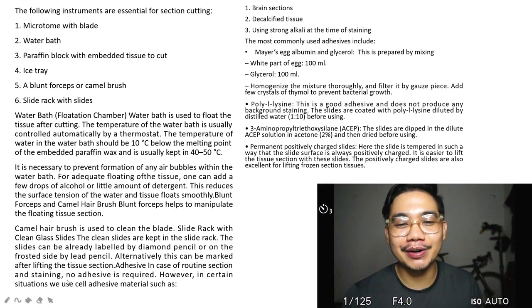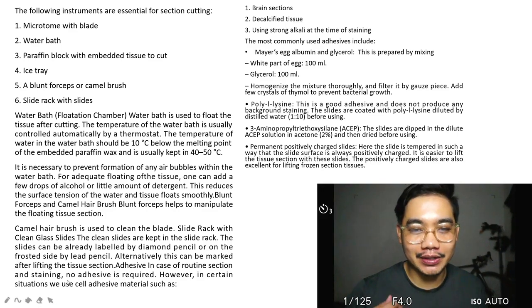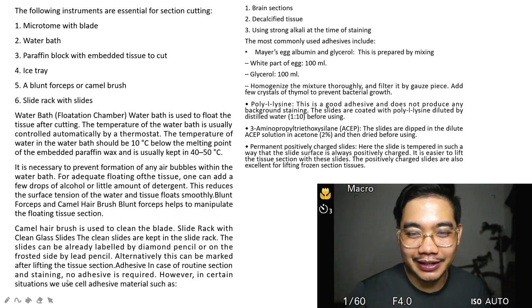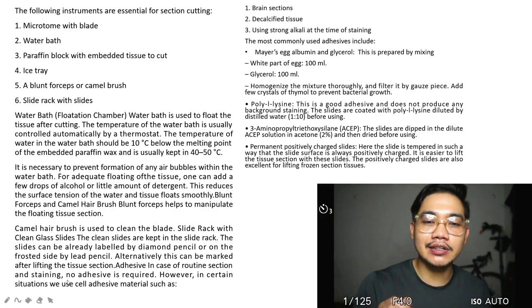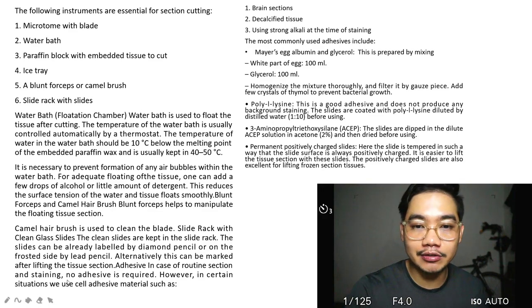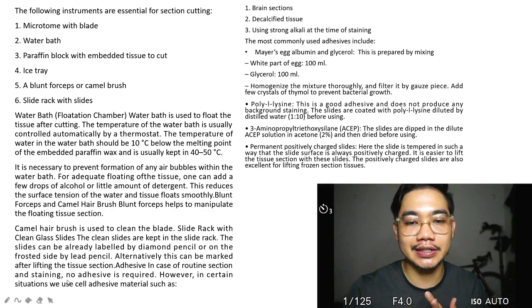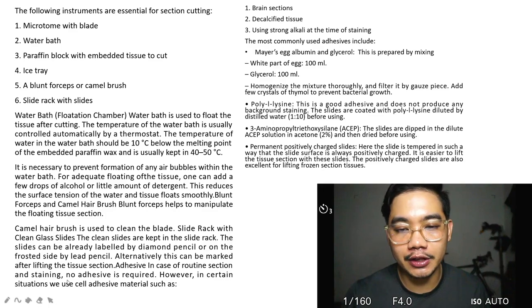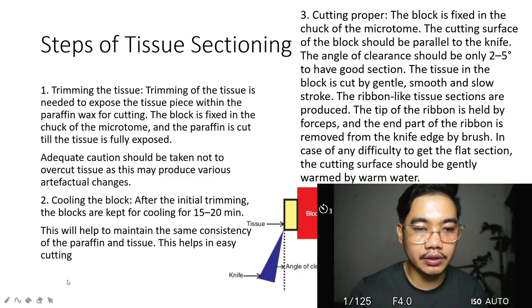So, as medtechs, at a certain time, they take egg albumin. And then there is poly-L-lysine. It's a good adhesive. So what is this adhesive? This adhesive, you put it on the slides before you fish out the floating section. It is applied first. And then there's the permanently positively charged slide.